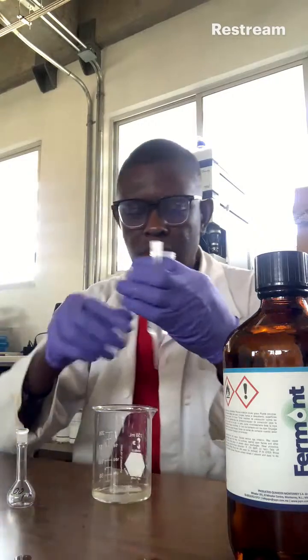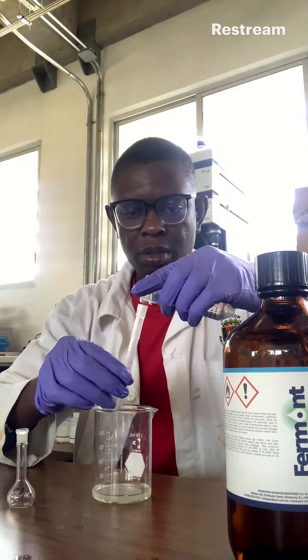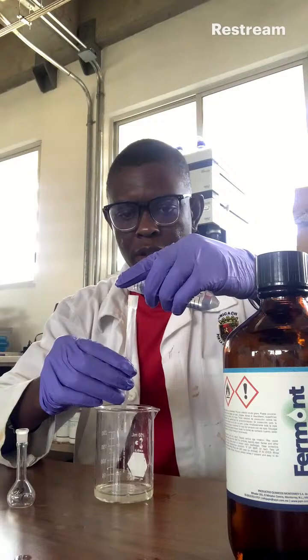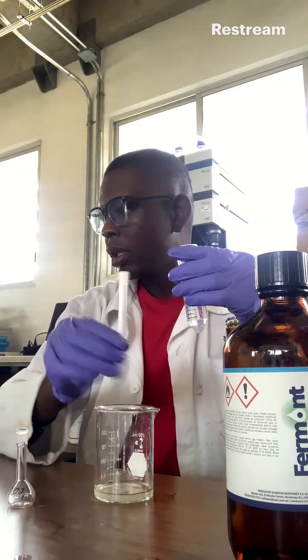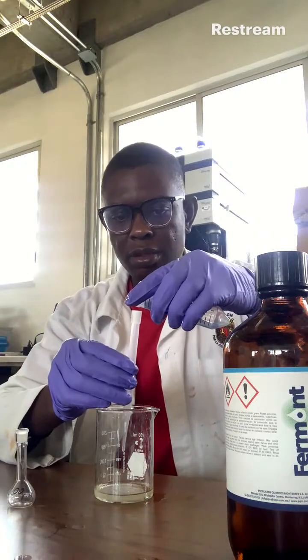So guys, I just need to wash this. I need to wash this.